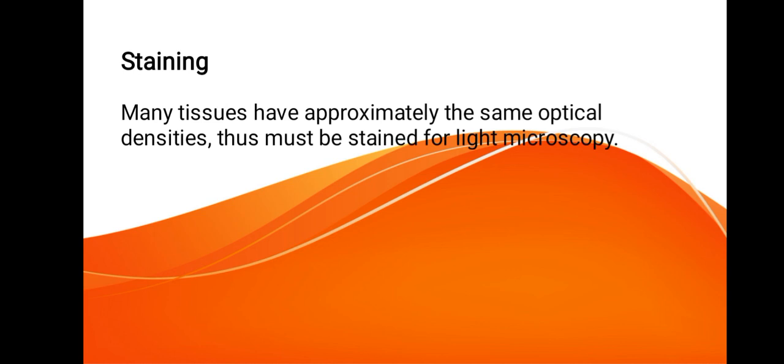Although various types of stains have been developed for visualization of many components of cells and tissues, they may be grouped into 3 classes. Stains that differentiate between the acidic and basic components of the cells. You have specialized stains that differentiate fibers and components of the extracellular matrix. You have metallic salts that precipitate on tissues, forming metal deposits on them.